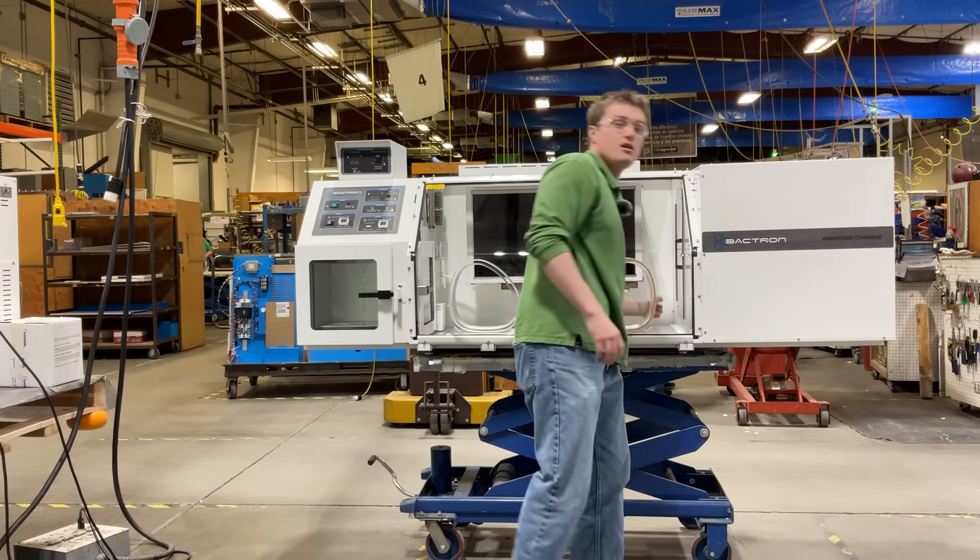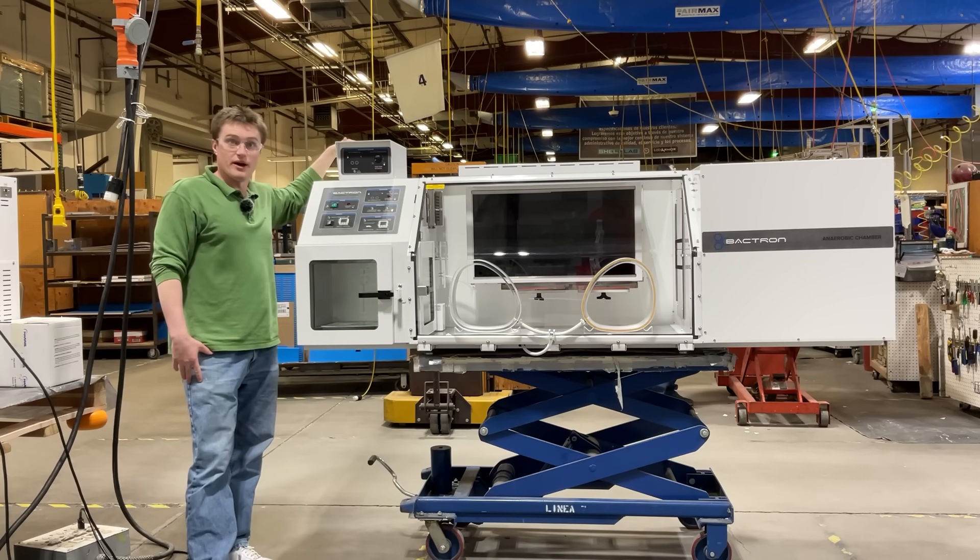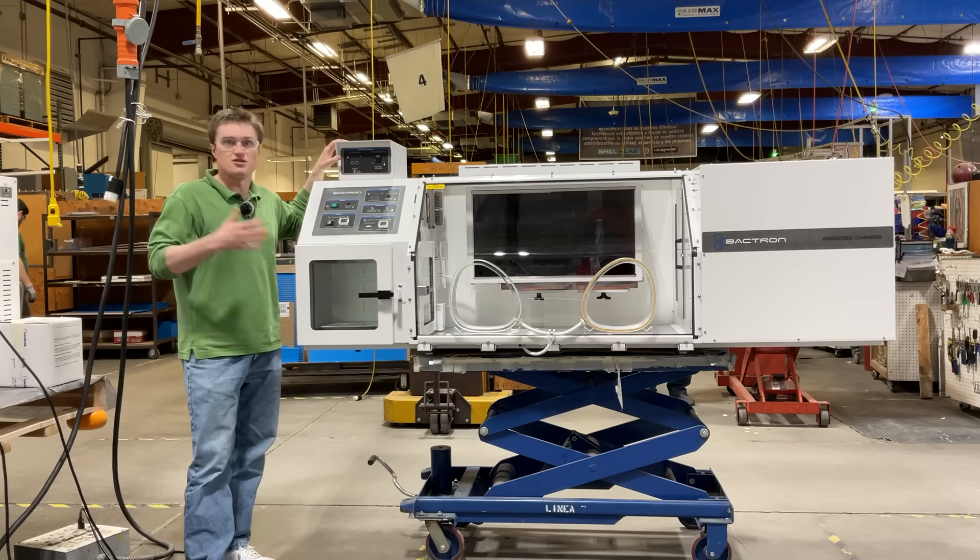This incubator is controlled by this auxiliary control panel. The main difference between the Bactron 300, 600, and 900.